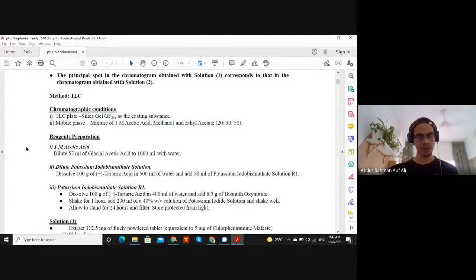So all these pharmacopoeia, contohnya macam US, British, Japanese and European, they can produce these substances, this reference standard kita panggil. Okay, so kenapa dipanggil sebagai reference standard? Because standard ni akan digunakan sebagai rujukan, reference. Okay, so bila kita buat most test, kita akan test our sample, our product with a reference. Kita akan bandingkan untuk pastikan quality of our product tu sama dengan quality of the standard.